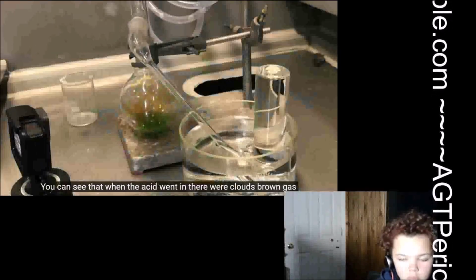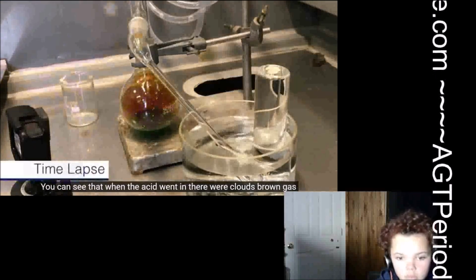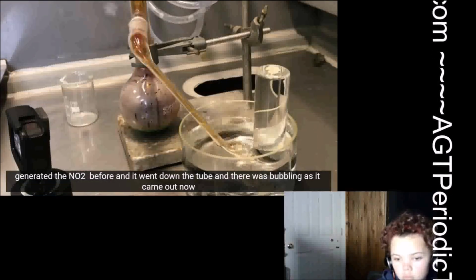You can see that when the acid went in, there were clouds of brown gas generated, the NO2 as before, and it went down the tube and there was bubbling as it came out.